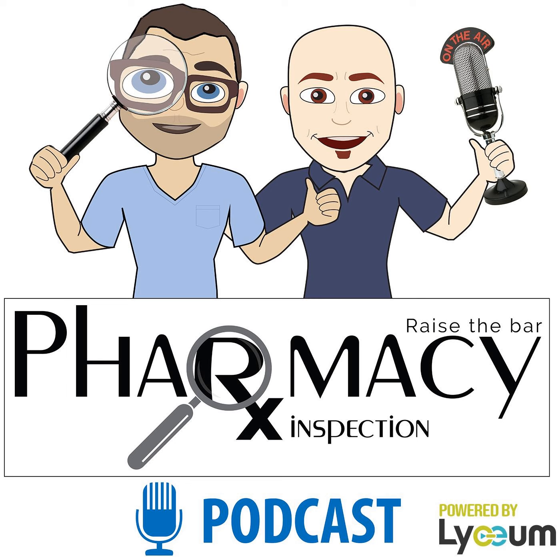So in this observation, the FDA notes that the PIC identified one possible cause of the contamination, but failed to test that theory. They didn't retest the air in that area of the buffer room to see whether or not it was in fact the cause. It's difficult for us to perform a full investigation with the limited information we have from the 483 alone, but we do know that there were 15 CFU found at a particular location, which exceeds the action level for the ISO 7 class buffer room.